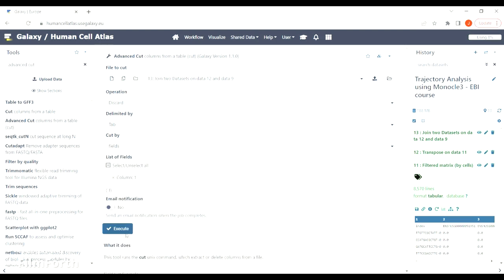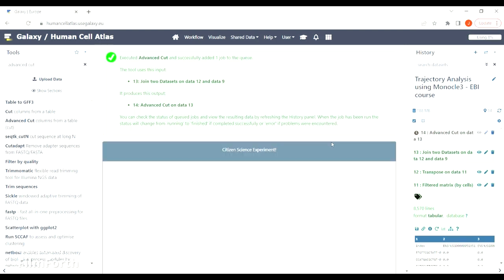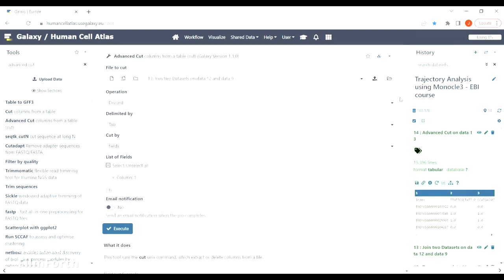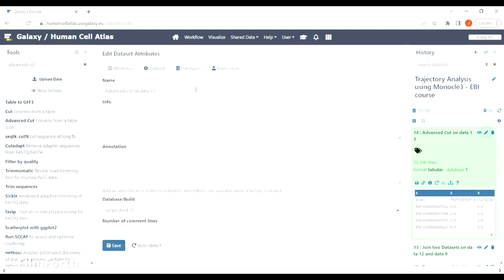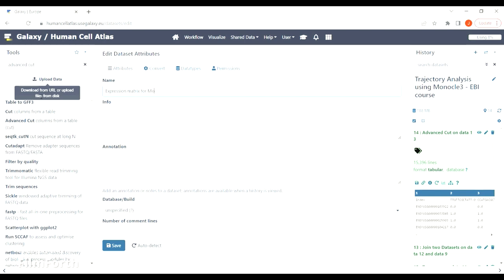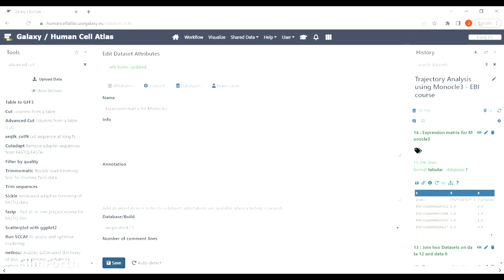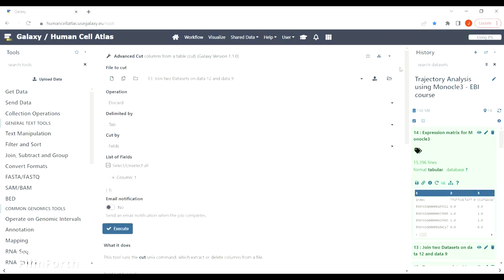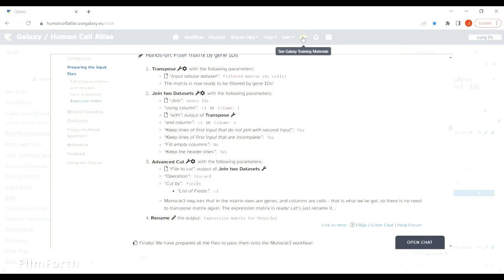Once it's done, the information we have in our cells file, genes file, and expression matrix file is consistent. We have now prepared all the files for Monocle 3, so let's get started with Monocle.